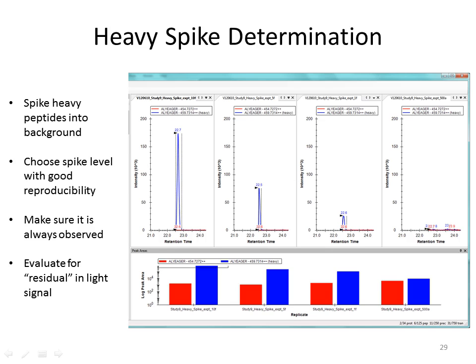So before you begin doing your response curve, you need to know how much of your internal standard you want to spike in. And I've gotten this question from a few different people already. How much do I put in? A lot of it relies on the technology that you're using. I know off the top of my head that most state-of-the-art triple quads made in the last 5 years up to present need a minimum of low femtomole to see a pretty good signal using nanoflow with a 1 microgram sample load.